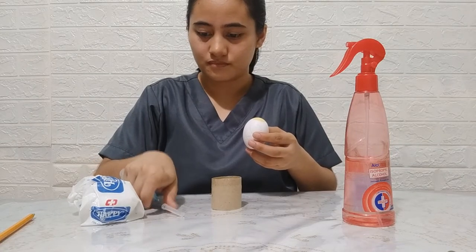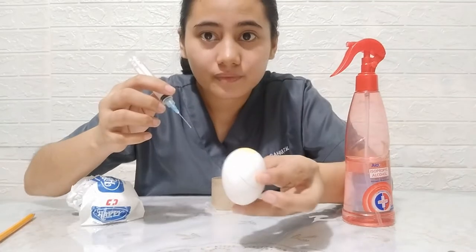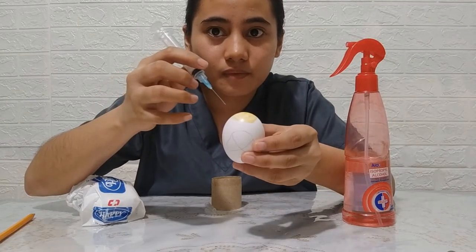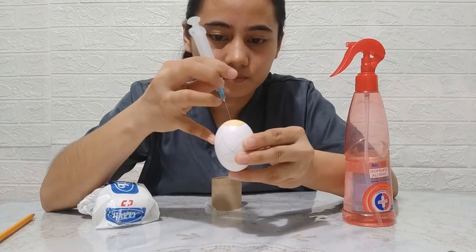Get the syringe and remove its cap. Identify a spot opposite the location of the embryo that will serve as your point of entry for allantoic inoculation of the virus.